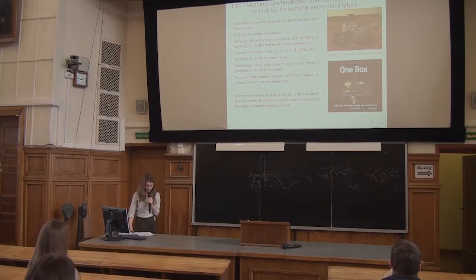It did not break through as PXRF did, but it provides complementary applications for lighter elements and through its remote detection capabilities. SciAps sells both XRF and LIBS in one box, supporting the idea of complementarity. And here is the slide to support sensitivity for light elements.